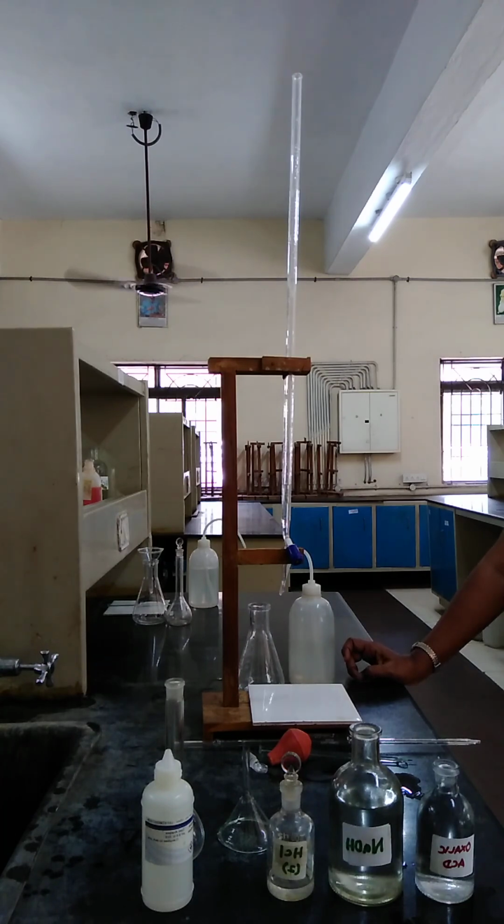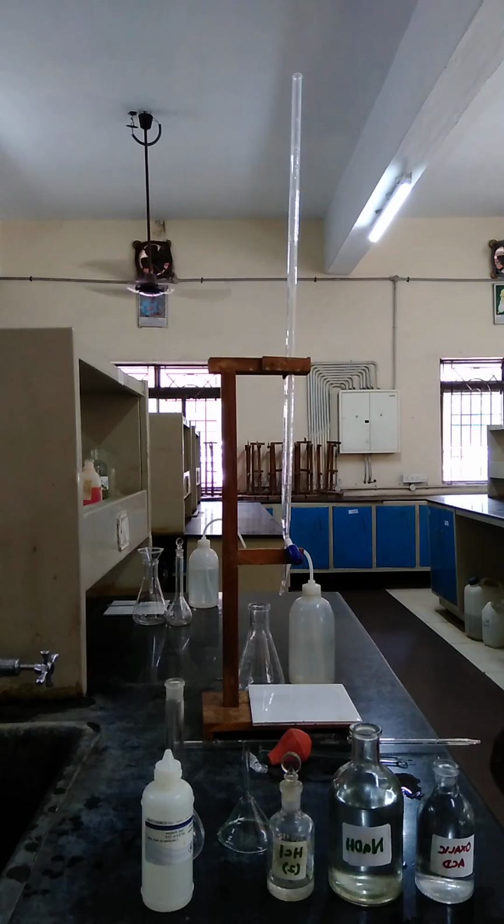Oxalic acid, we didn't label its normality, but it has a given normality. Okay, so we take the oxalic acid in solid form and then make up with the known normality, that is 0.1 normal oxalic acid, to standardize the sodium hydroxide. Okay, so now we have to take the sodium hydroxide in the burette.